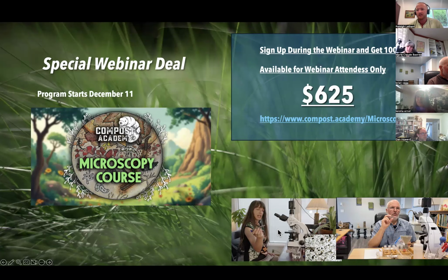The amount of knowledge and shortcuts you get by learning one-on-one with them and with a group is priceless. We hope you join in. This is going to be really fun and really make you fall in love with microscopy. And if you're already a microscopy expert, you're going to level up your training to a whole other level. This is going to be a really great 6 weeks.